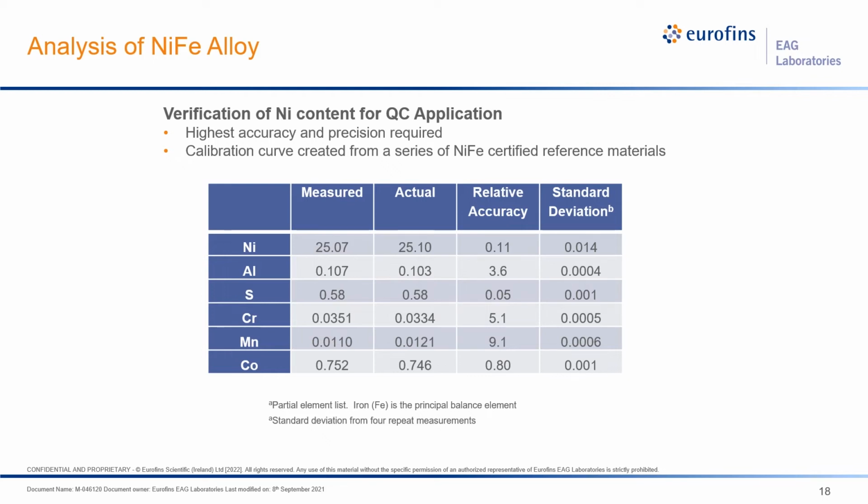Even the trace elements have good accuracy and precision using this method. 5% relative accuracy for chromium at approximately 350 ppm, for example. When the absolute highest accuracy and precision is required, WDXRF with matrix-matched standards is the tool of choice.